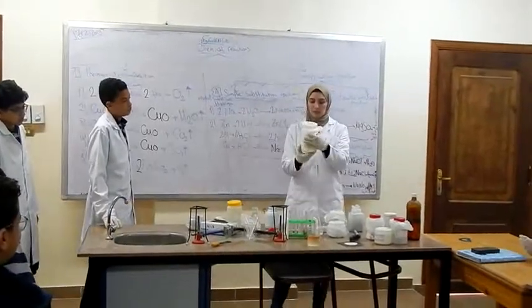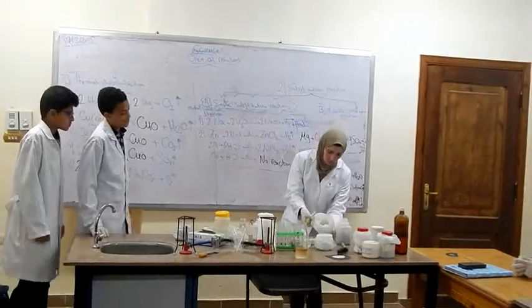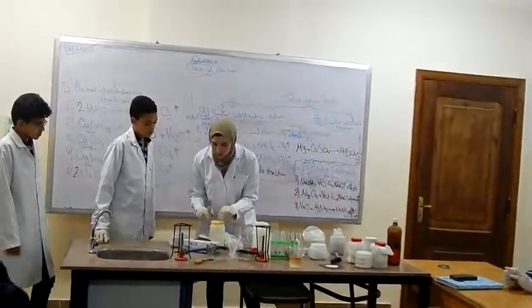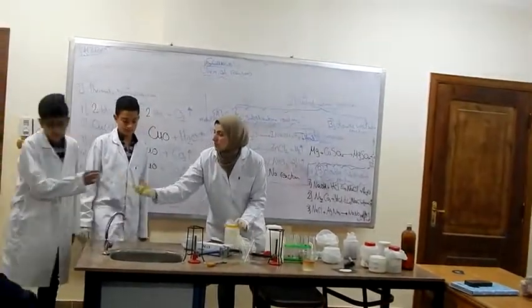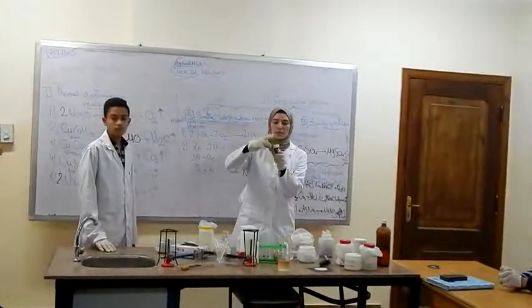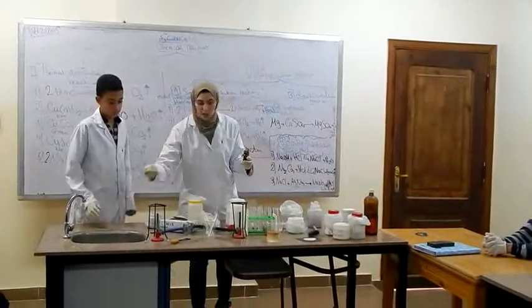Sodium chloride and some silver nitrate.